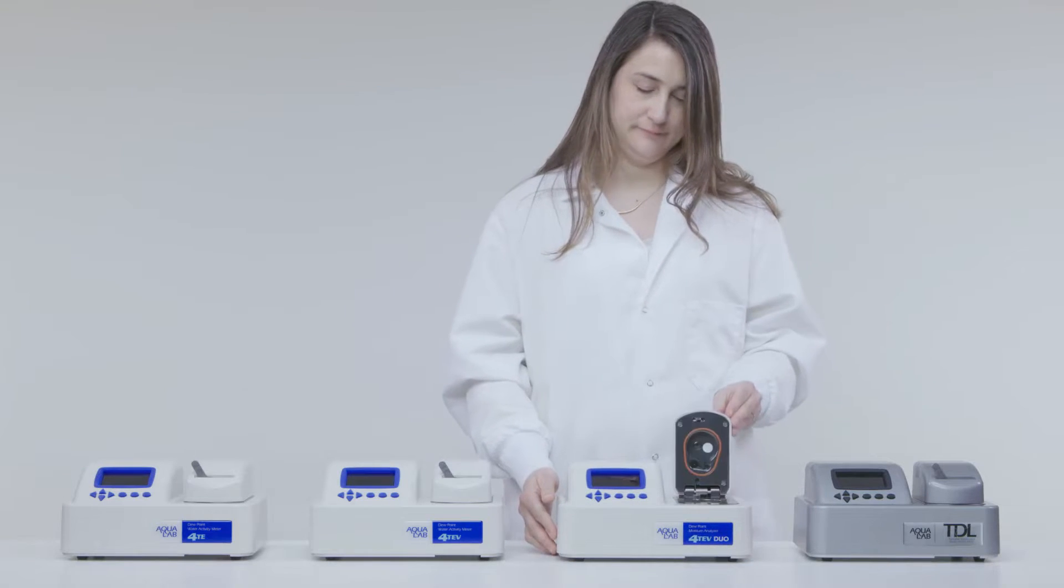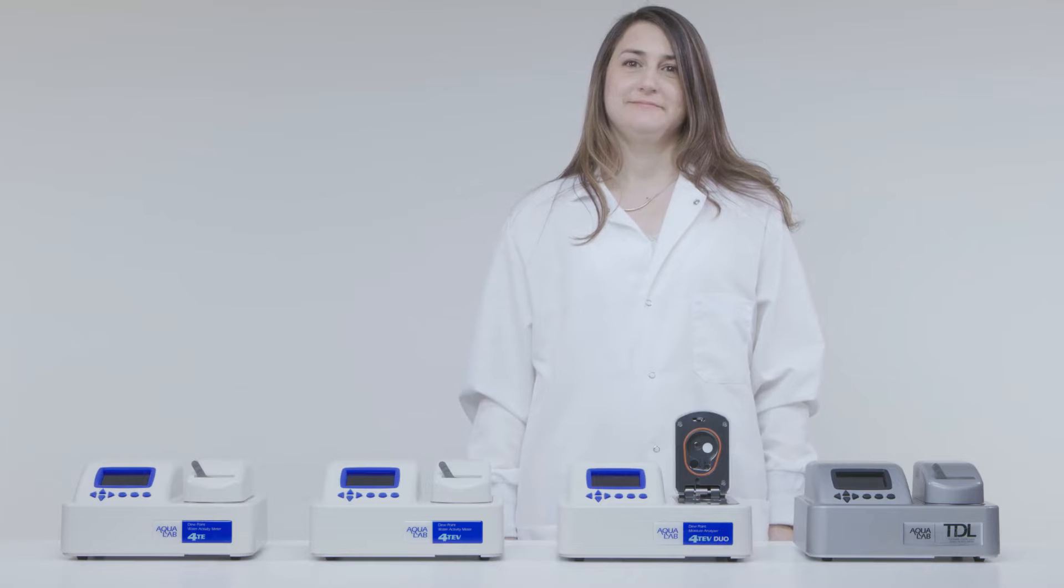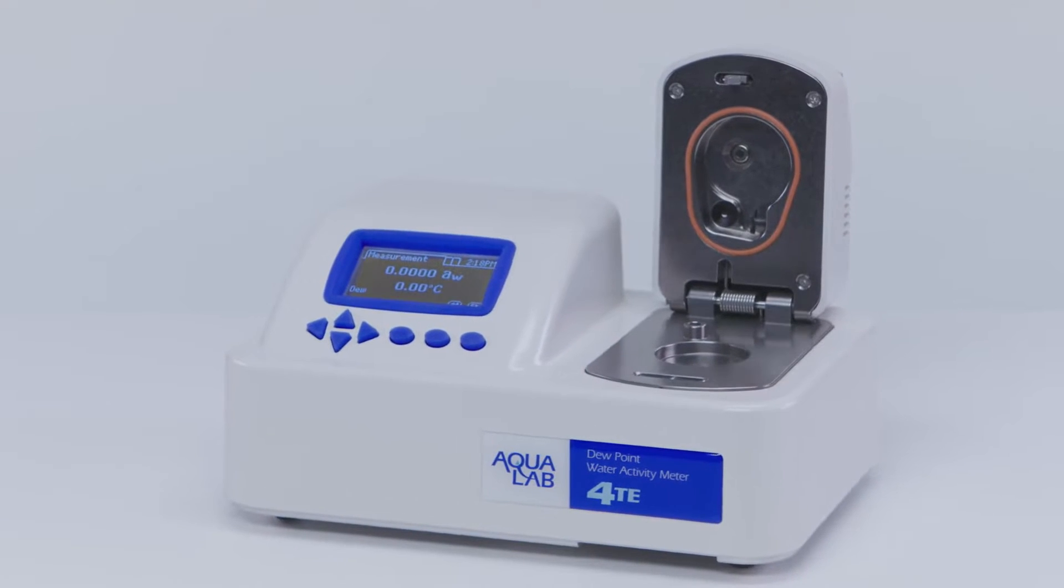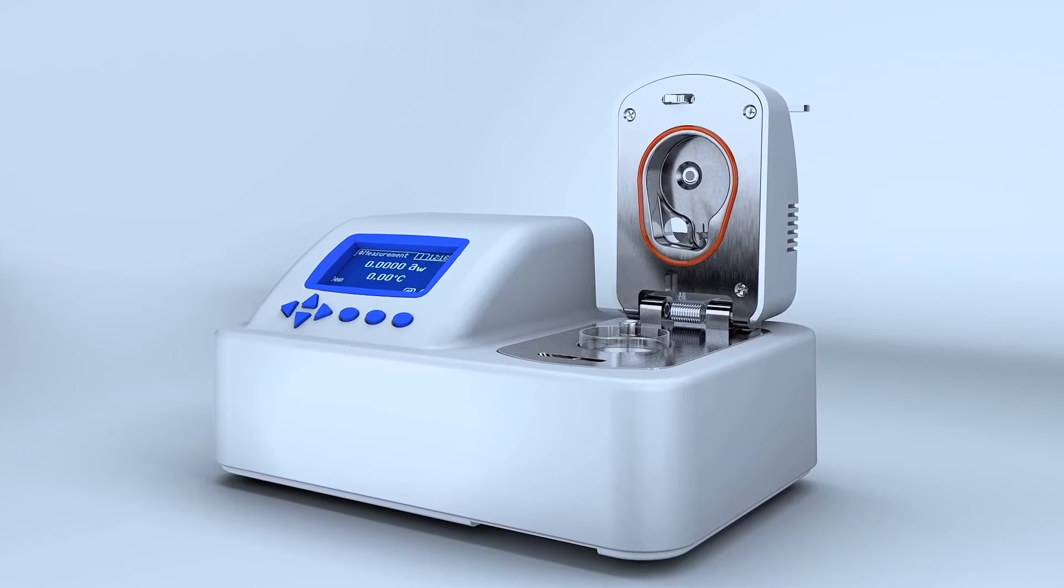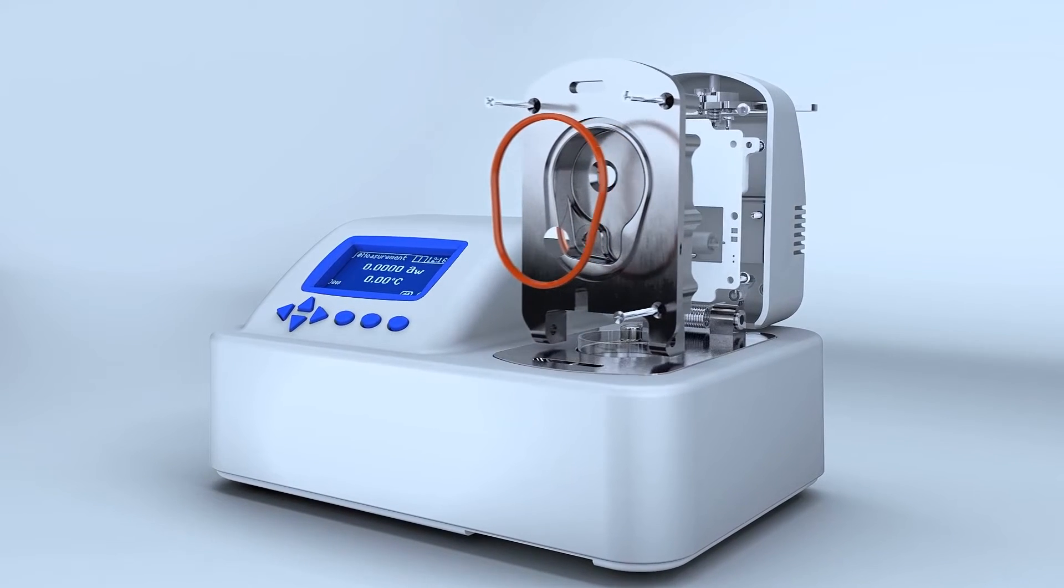There are four different types of Aqualab water activity meters. The one we're using in this video is the Aqualab 4TE. It uses the chilled mirror dew point method to measure water activity.